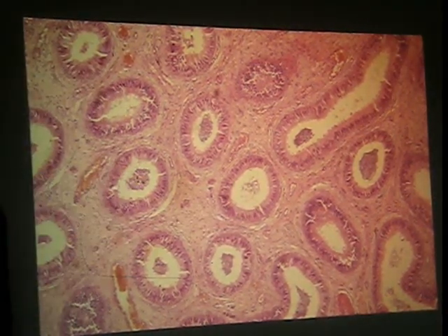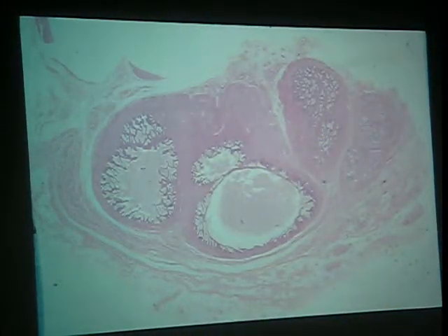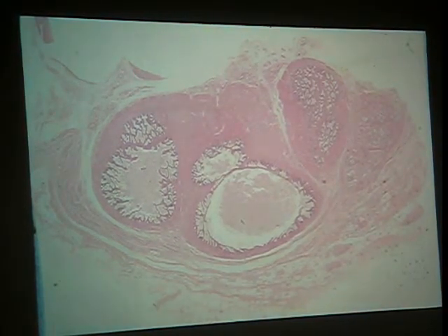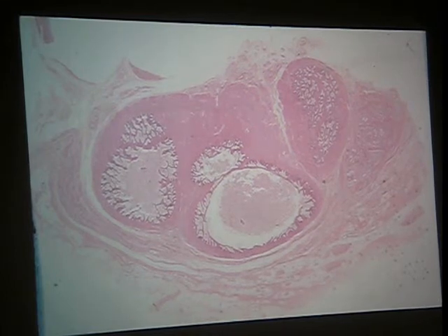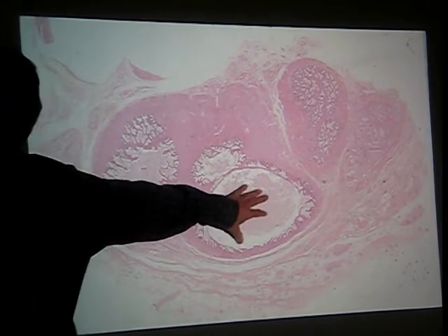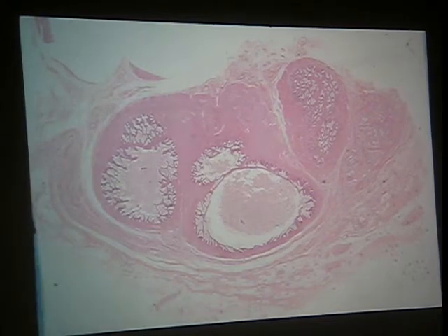All right, so epididymis. Now we come to the secondary sex gland. And the way I prefer to deal with the seminal vesicle and the prostate is by looking at the slide. All right? This is an example reasonably representative of seminal vesicle. And you look at this slide, what comes to mind is you've got a tubular structure that has pretty large lumen, and the mucosa is folded or plicated, right? Somewhat loosely analogous to the oviduct, but you would never make that mistake.